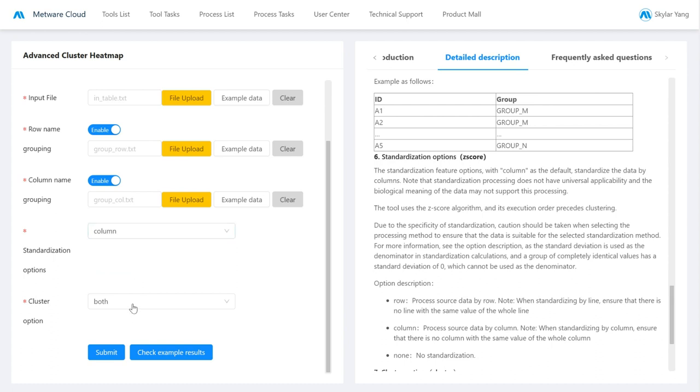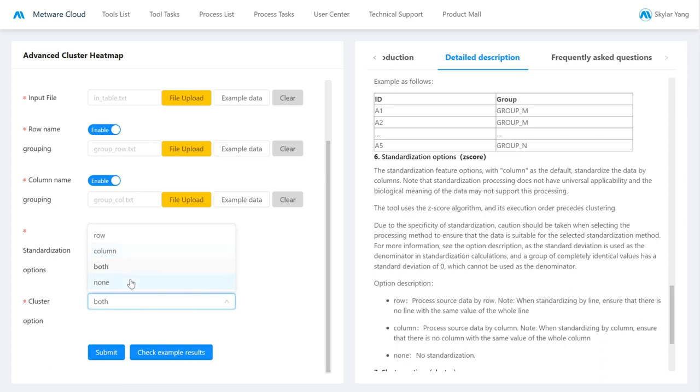And finally, there is the clustering option where you can disable clustering or you can just let the program perform clustering either on the row, on the column, or both.